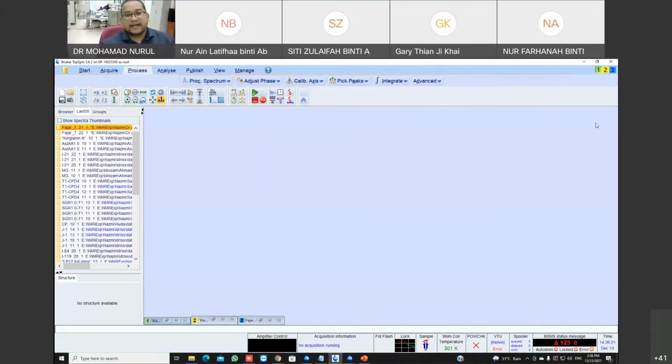Okay, we already create the folder for every supervisor. Okay, we have prepared the guideline here. So you can easily use the username that has been stated here and also the password. Okay, it's clearly stated in these sheets. Okay, make sure you know how to do it. Okay, anybody who wants to submit the NMR, please use this form.